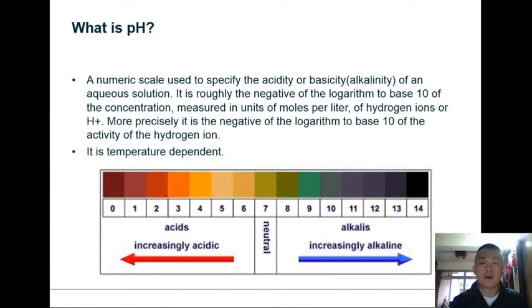Now as you may know, pH determination is a commonly used analysis inside the lab. To start things off, let's talk about what is pH. pH is actually a numeric scale used to specify the acidity or the alkalinity of an aqueous solution.